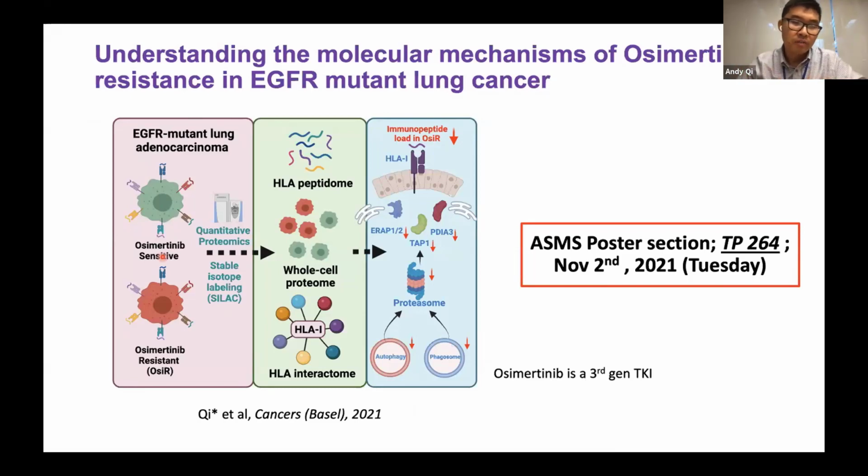We really want to quantify the immunopeptide, because there are so many steps in the sample prep, and many of those could go wrong with human error. So to eliminate the possibility of systematic error, I think it must be metabolic labeling of the cells and pooling the cells, and then every cell line goes through the same process to eliminate the potential issue.